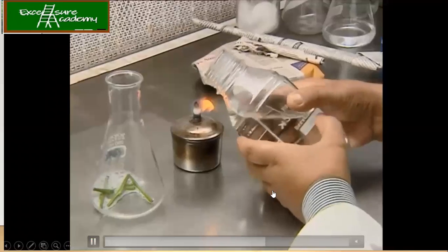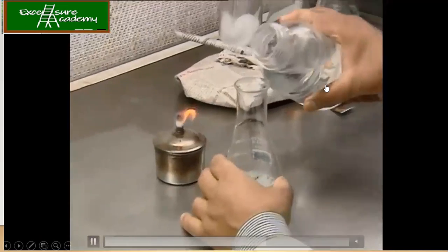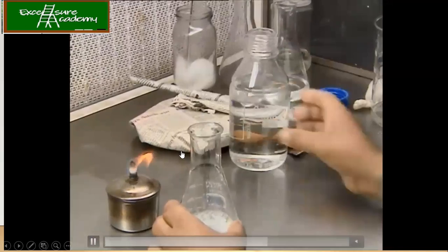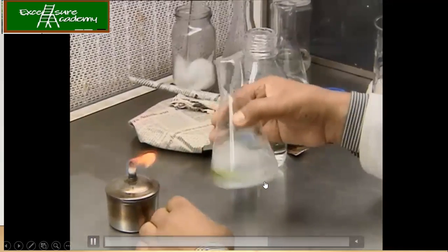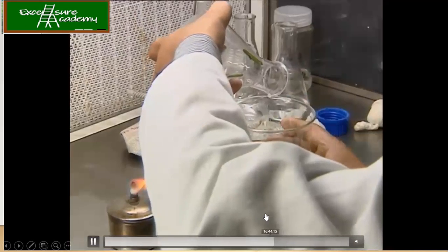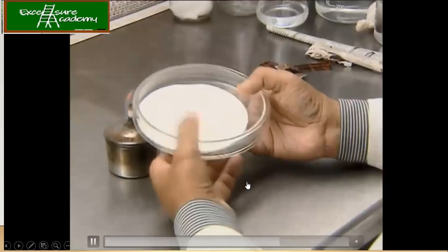So this is the media; everything you need to heat sterilize, because at the rim there are chances that bacteria might be present. Again, washing is being carried out, 2 to 3 times or maybe 4 to 6 times you need to do it. Then drain it, take the explant, and dry it.